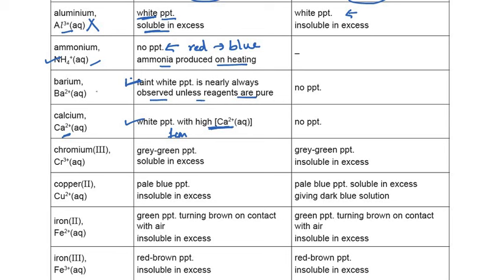So here we are left with only this chance where Ba2+ should be present in Fa8. For Fa7 we have observed that there were no precipitates but ammonia gas was produced. So Fa7 we knew it's NH4+. Now for Fa8 there are chances that Ba2+, that is barium ion, is present according to our observations.